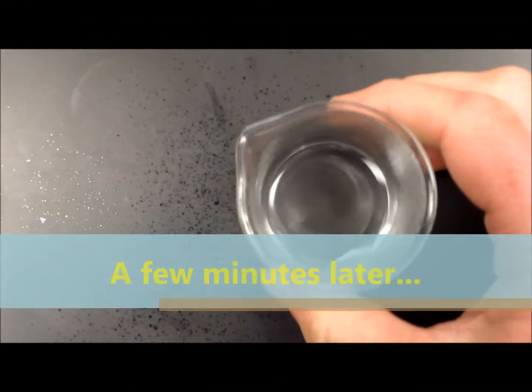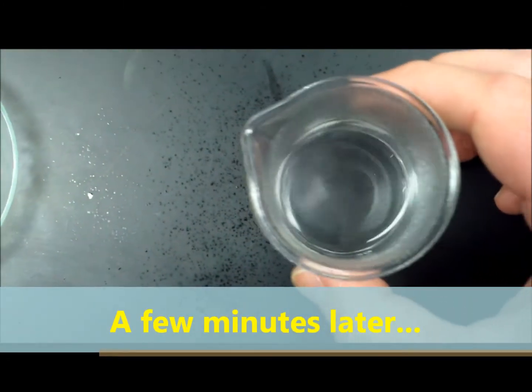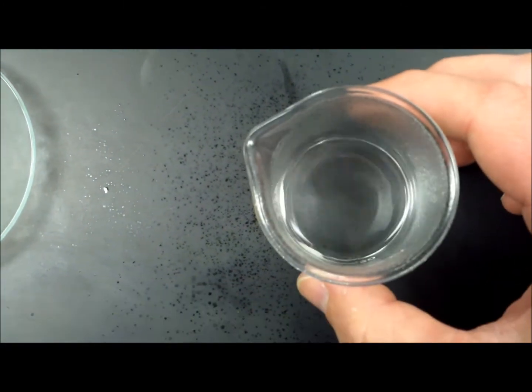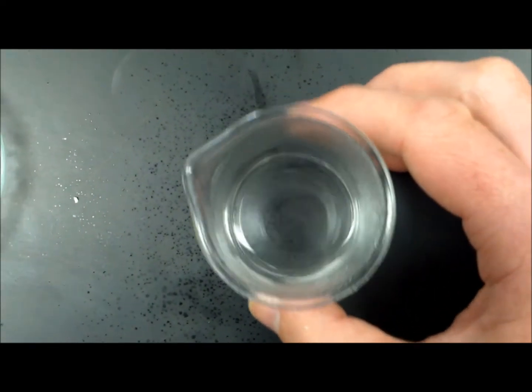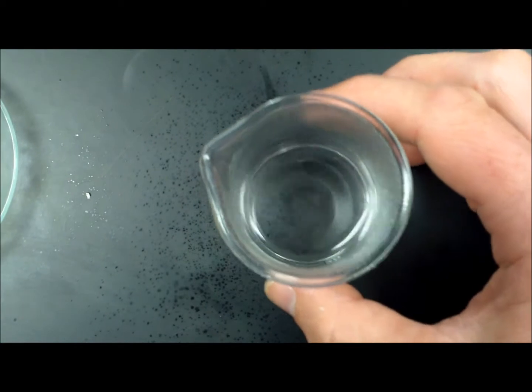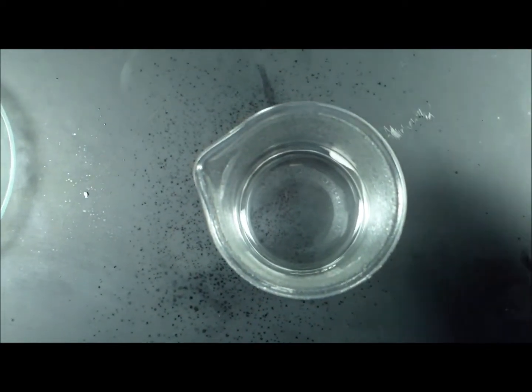So this reaction is almost done, but I can see that there's a little bit of magnesium ribbon just floating near the top. You can see it moving around on the surface there. So I want to just give this a little bit of a swirl to move around the liquid and move that magnesium just to encourage the reaction to go to completion.